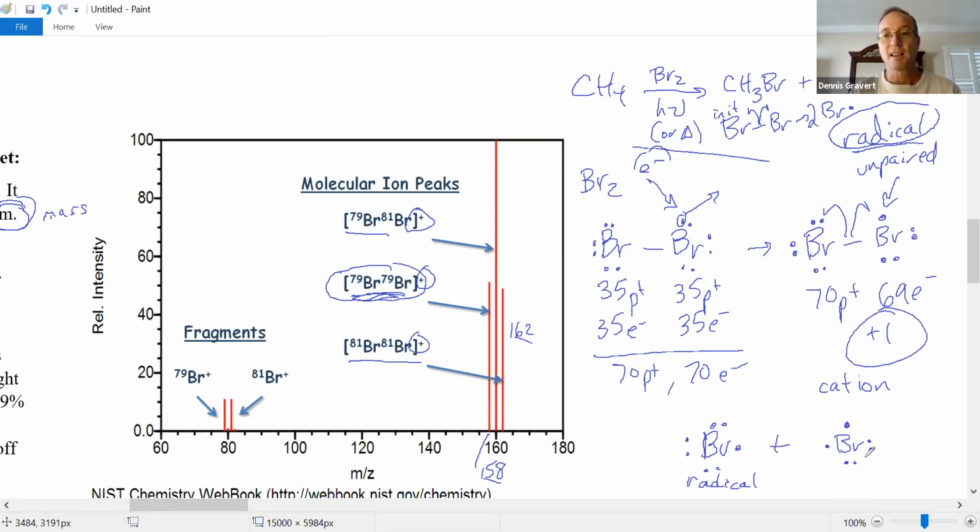And so if you count up the electrons here, or maybe what you can do is just ask, hey, bromine, why don't you pair those up? And that can happen. It can be a diradical, or it could just have no radical character to it. It could actually pair up these electrons. And then it's missing a lone pair. This is a cation. This is also a cation.